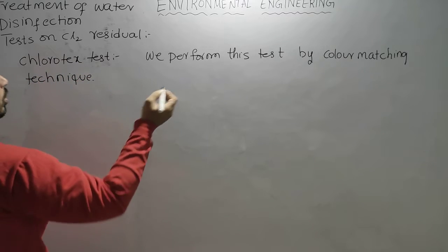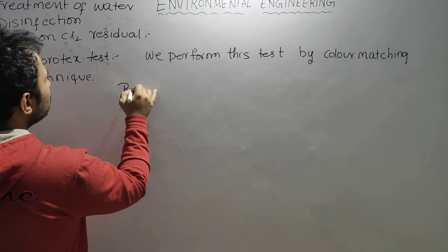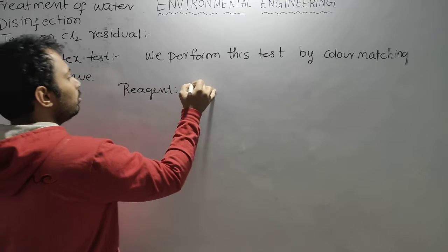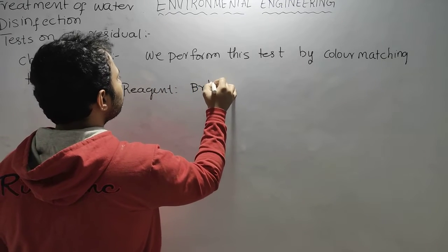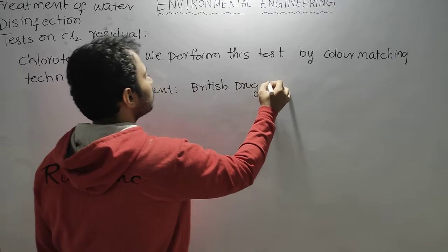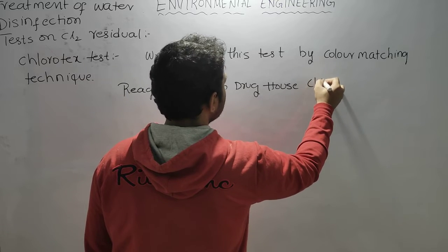The reagent which we use here is BDH chlorotex. BDH stands for British Drug House, so the reagent is BDH chlorotex.